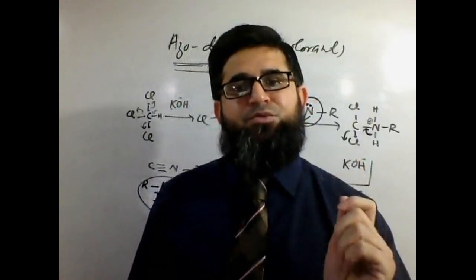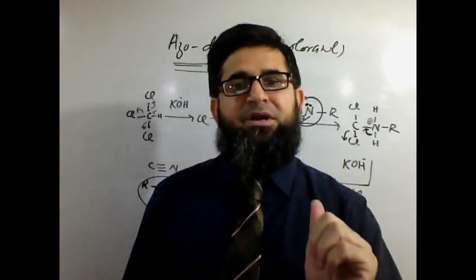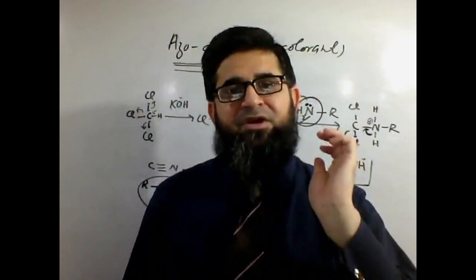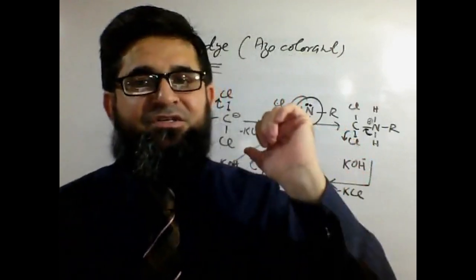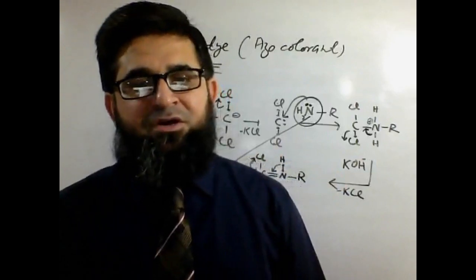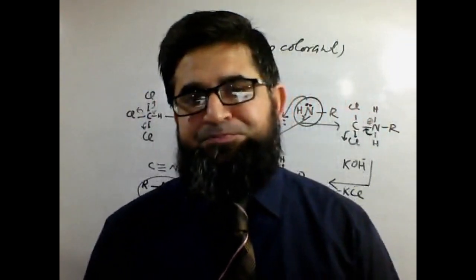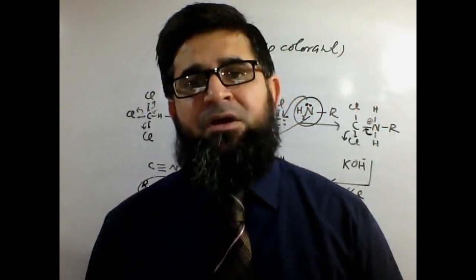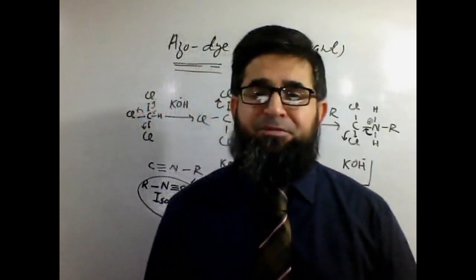Secondly, the students who are in the lab and are interested to learn to identify compounds using different conformity tests, this carbylamine test is very much important for them as well, to identify given unknown compounds. I hope you got the message. You have got an idea about the identification of the amines, especially the primary amines.